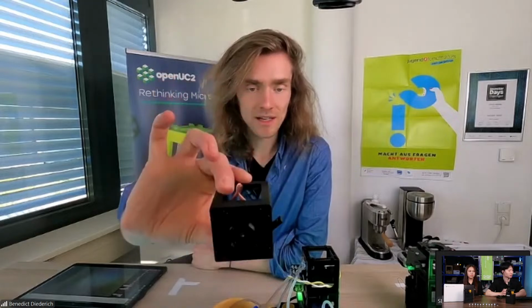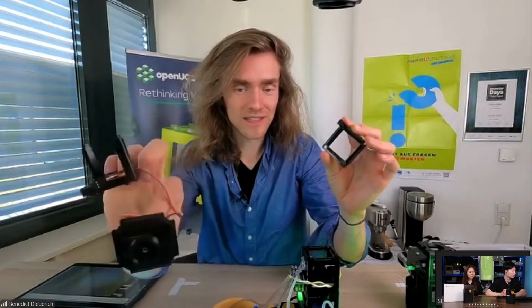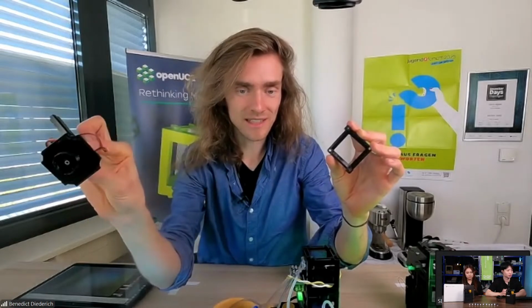So you, for example, can also use this servo. It's just another module that, well, fits in the cube. You see already this form factor. It looks a bit like a stop sign, and you just fit it in here. Then you put that in the cube. And then you put this cube on the microscope.